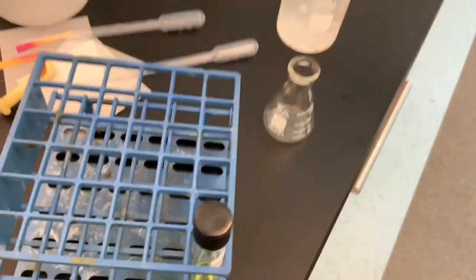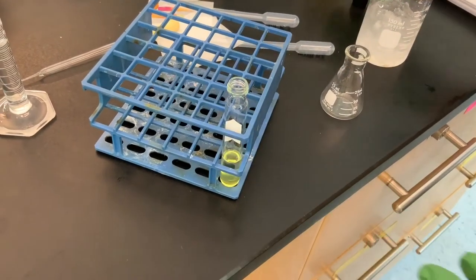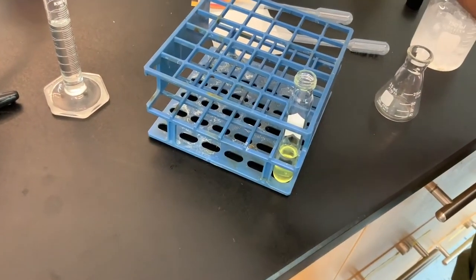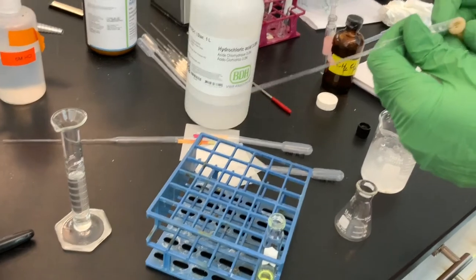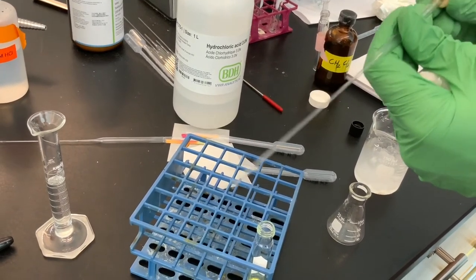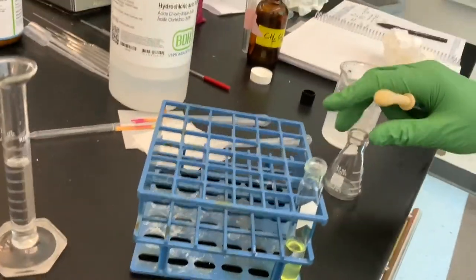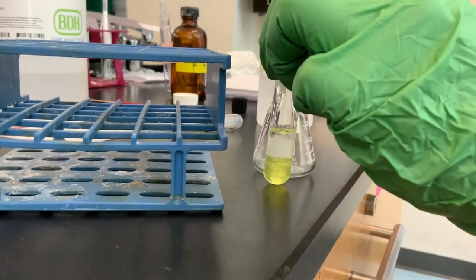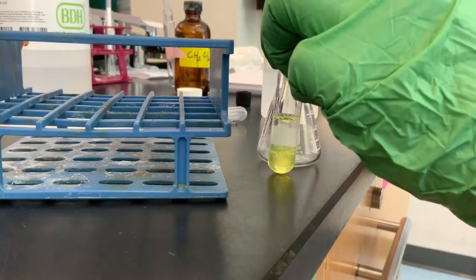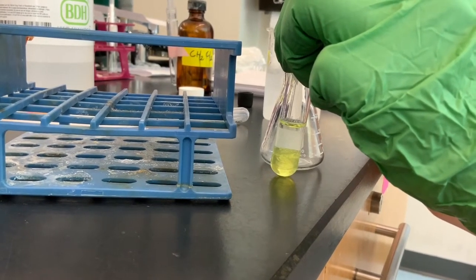Okay, so I've got my ice water bath, and once again we're going to separate our two layers. The top layer is always the aqueous layer. I'm going to use a new Pasteur pipette to avoid contamination. Just like we did before, this is now our liquid-liquid extraction, on a micro scale, of course. What we should show you is actually the large scale that we normally do, which is with a separatory funnel, but here we're doing it on a micro scale to minimize waste.